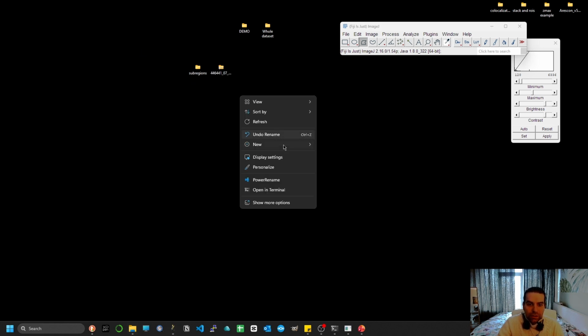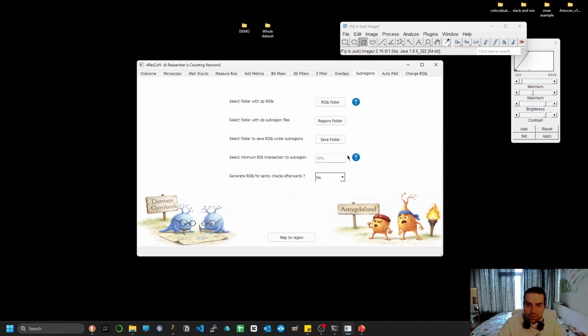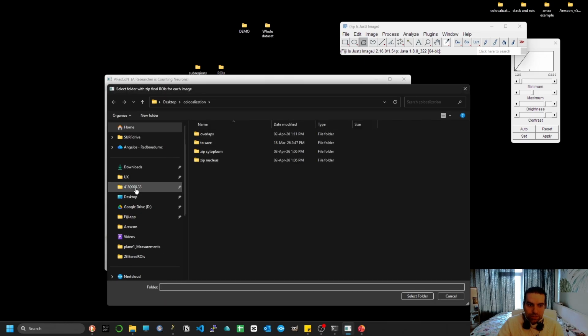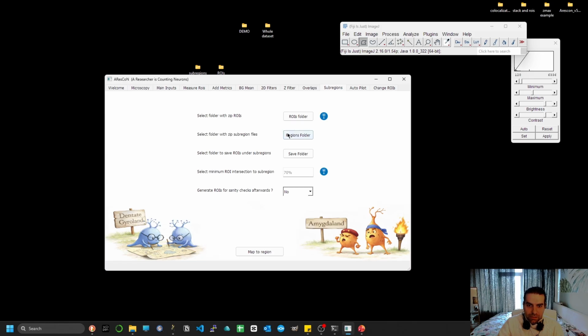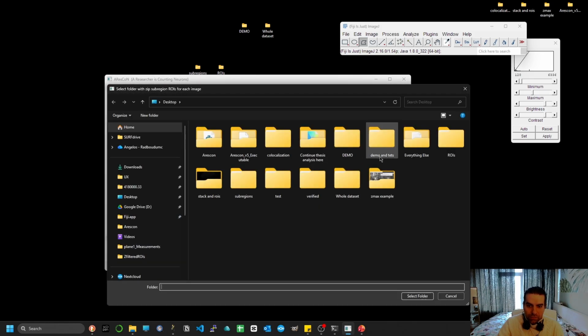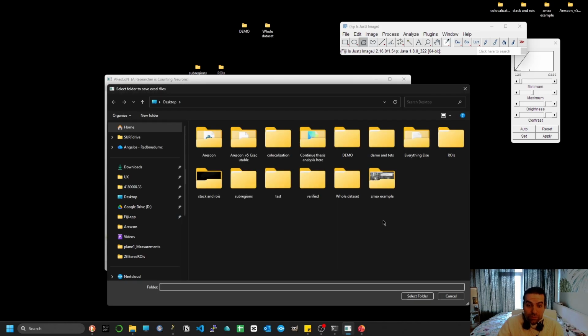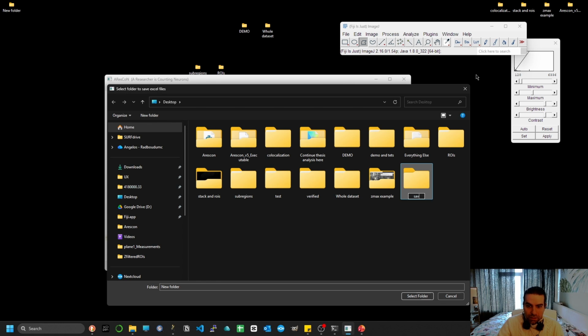And let's call the other one, I don't know, ROIs maybe. Alright, so we select the folder with the zip ROIs, and this is that, and the folder with the subregions, which is this, and a save folder as always. I'll name it save.